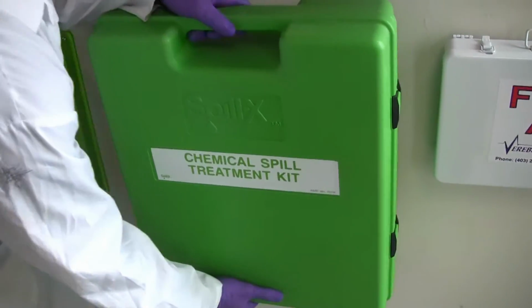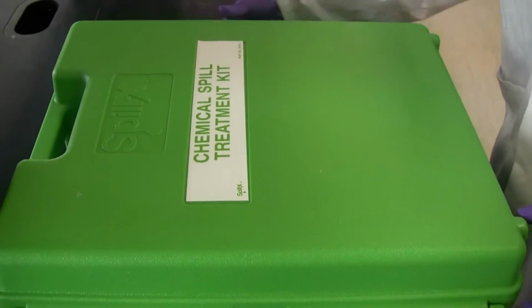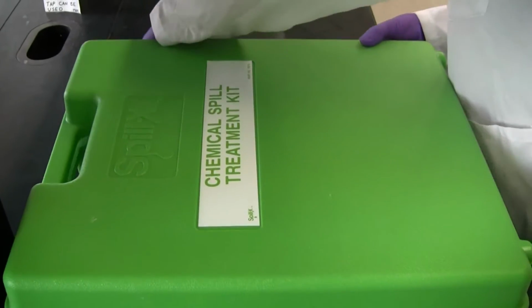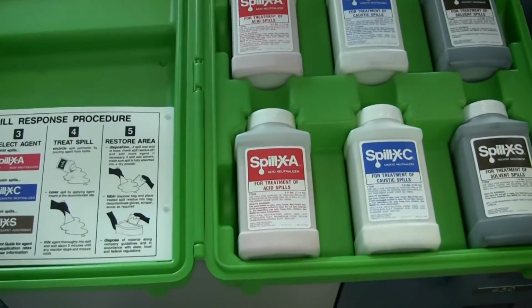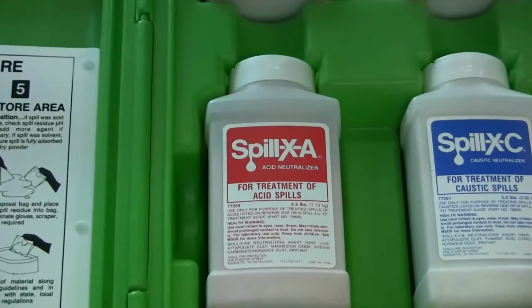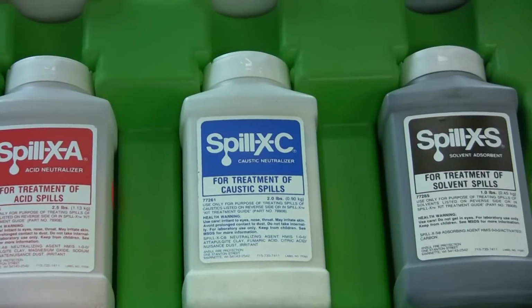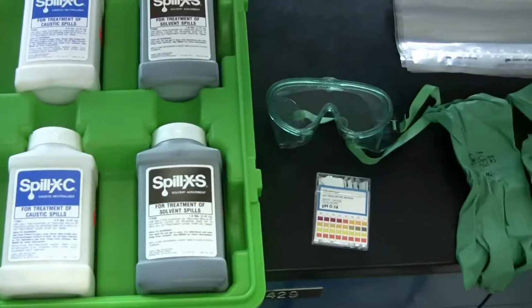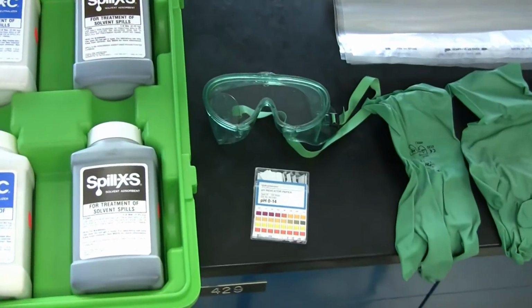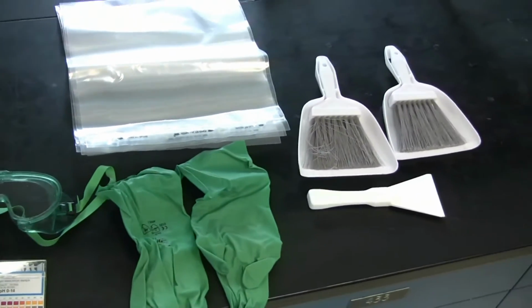There is a chemical spill treatment kit for if solvents, bases, or acids have been spilt on the ground in large quantities. Inside, you will find special powders to neutralize acid spills, caustic or basic spills, as well as solvent spills, which could evaporate and be harmful. There will be pH strips, industrial goggles and gloves, bags, and spatulas and dustpans for scraping up messes.